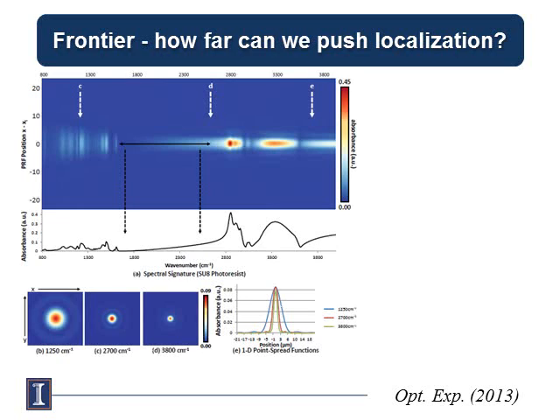Here it turns out that if we think of these as spheres, as we've modeled them, you have lots of information, the so-called spectral distortion, which is really nothing but the effect of morphology on these spheres. So even if you're not thinking of chemistry, even if you're thinking of simple things like morphology and you have multiple spheres, you can use their scattering functions from the same spatial volume and actually localize their positions.